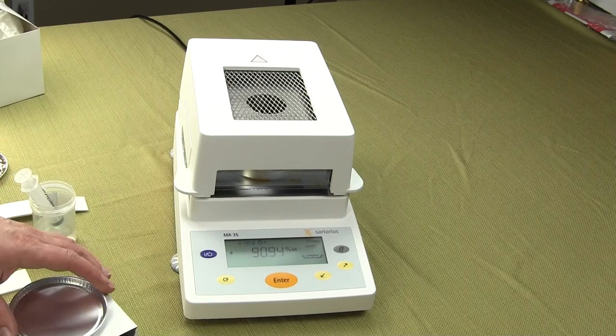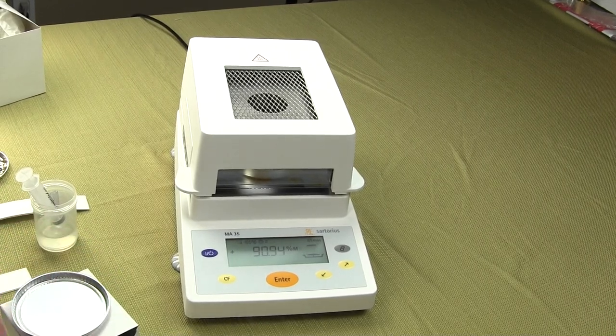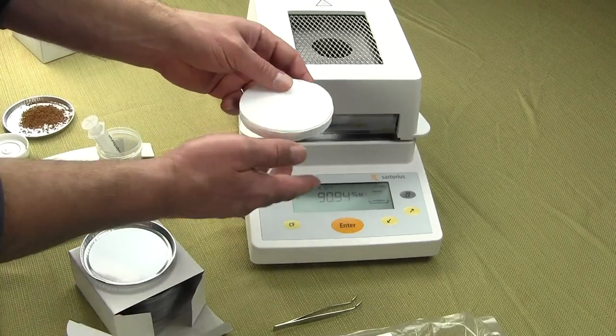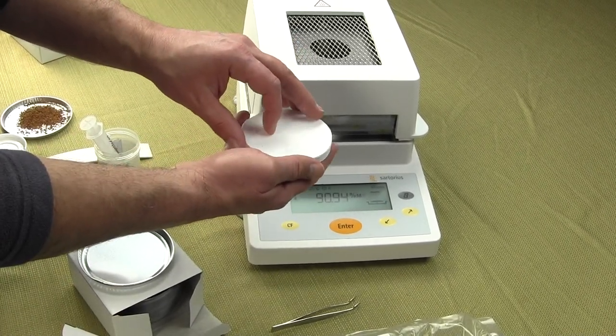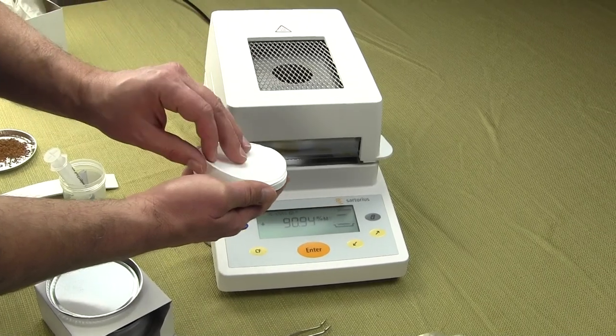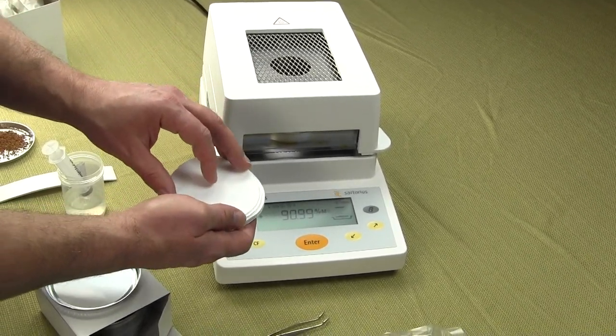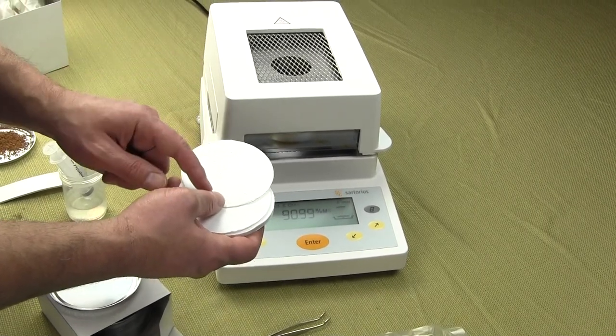These moisture pans also work on Mettler balances, Ohaus balances, and Adam equipment. Filter pads are used for any kind of material that you'd call a splatter — for example, if you were trying to determine the percent moisture of ketchup.